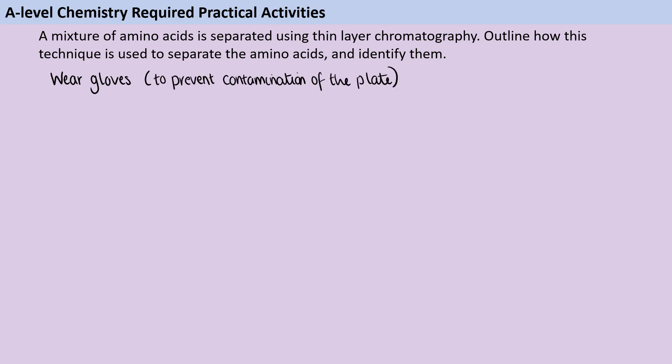You're going to draw a pencil line at the bottom of the plate parallel to the bottom of the plate, and it's important that it's far enough away from the edge of that plate that when you add the solvent the solvent doesn't go over the line. So we're going to make sure that we're drawing it at least a centimeter from the bottom, maybe a centimeter and a half.